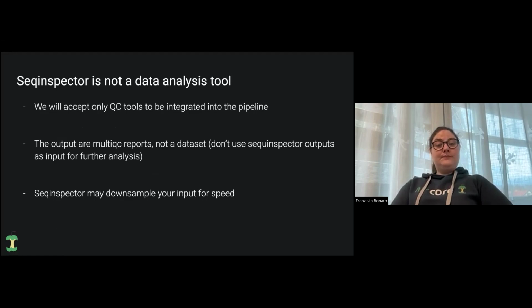The output is not a data set, so it's not something that will then be used further in analysis, but the output is meant to be a MultiQC report, or in some cases where it's not yet integrated into MultiQC, you can still see the entire output of the specific tool in its own results folder. But the output is not a data set.